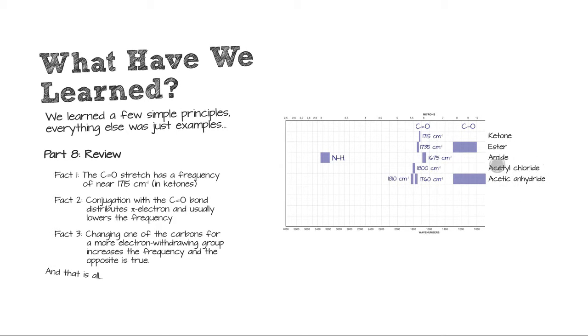If your mass spec says there's a chlorine in there, I'd go with acyl chloride. Acetic anhydride, again, very high peak because, of course, both those carbonyls are now attached to a very electron-withdrawing oxygen, and then split a little higher and a little lower by the fact that the two frequencies are combining. And you'll expect to see a CO peak in that, of course.